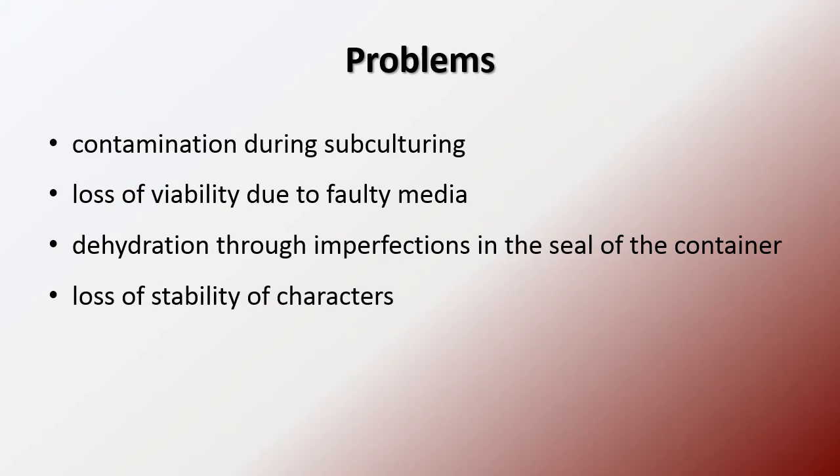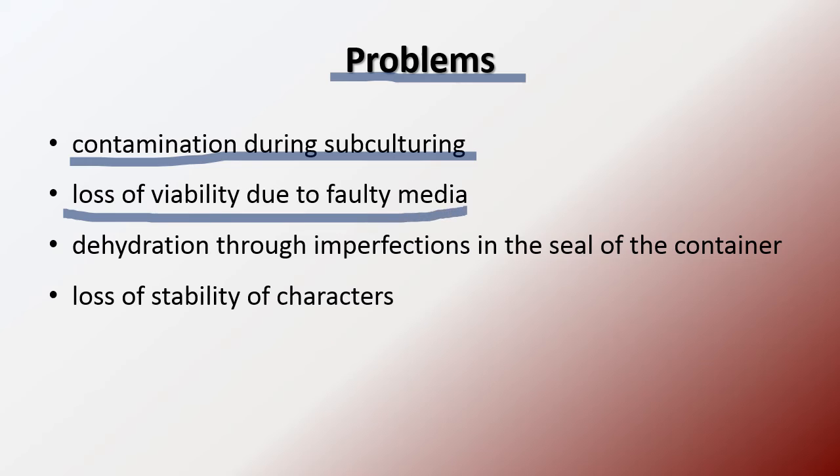Okay, various drawbacks of agar slope cultures have been reported for maintaining and preserving pure cultures. Agar slope cultures have been reported to lead to contamination during subculturing, and also to cause loss of viability due to faulty media.